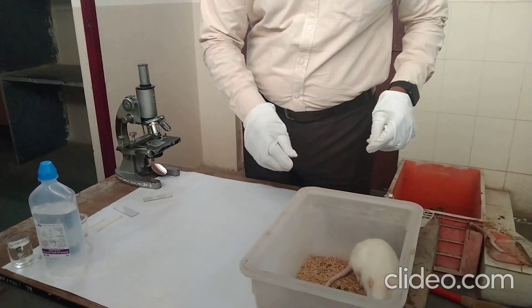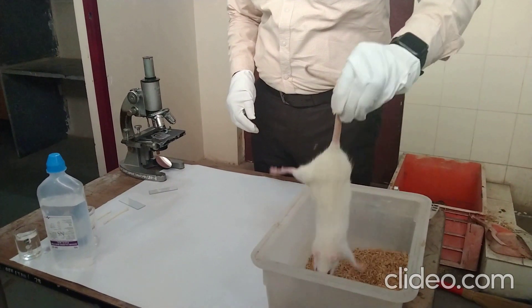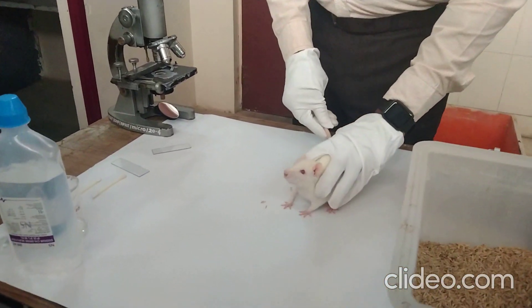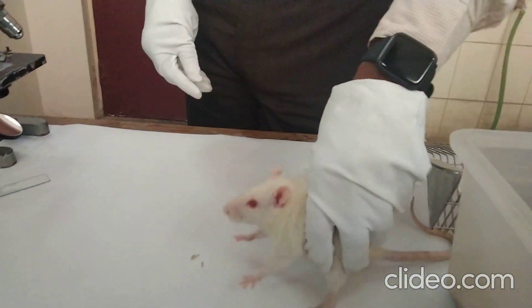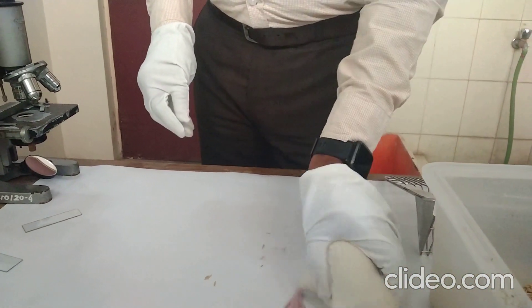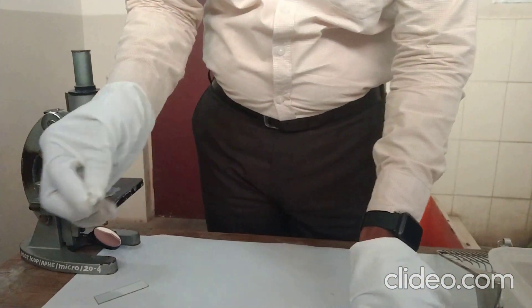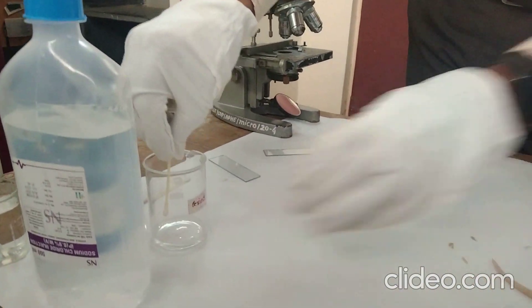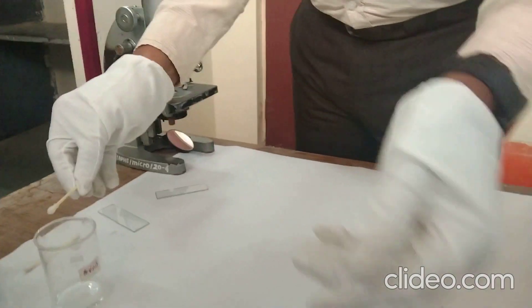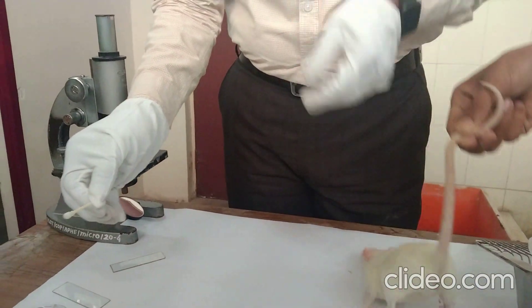To study the estrus cycle, we need a female rat. Take the rat, then take the vaginal smear. For that purpose, take an earbud and dip it into normal saline solution, then soak it with normal saline solution.